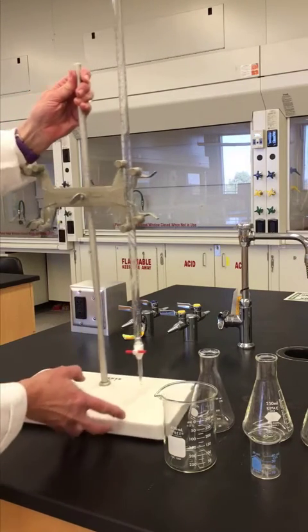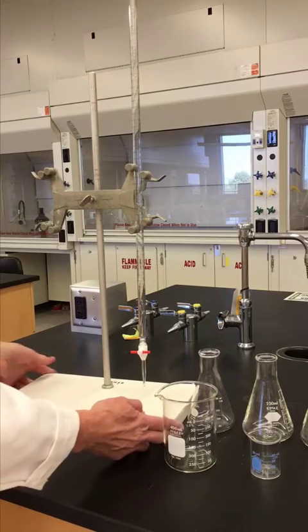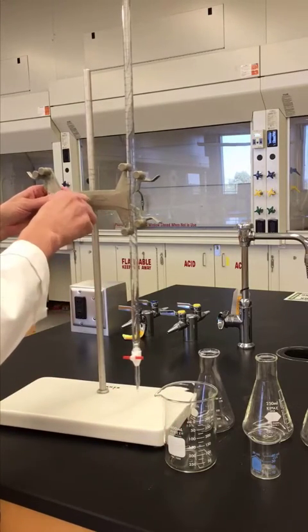First you need what we call a burette stand. The stand is white on the bottom and it holds a burette clamp.